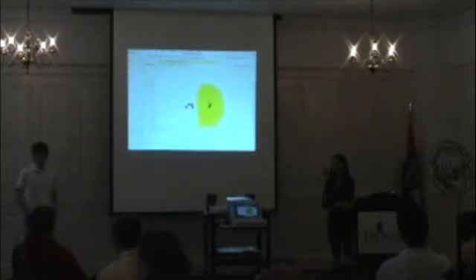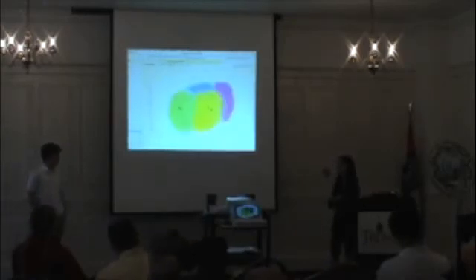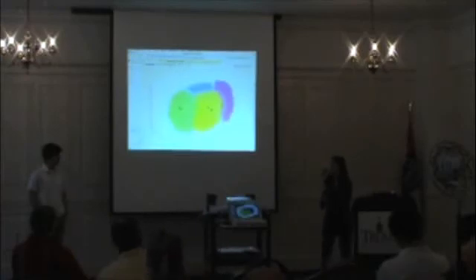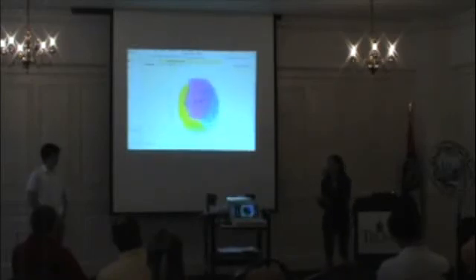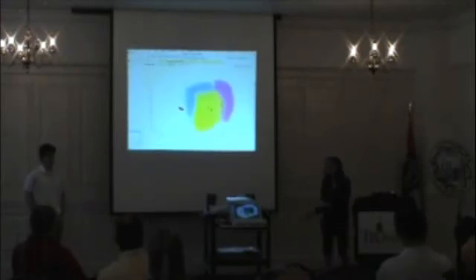So, are you planning to go with this combination method for your segmentation? I think so. We're going to do some more research. Picking an algorithm, I think, will be based off of ease of implementation to some extent. Like, if it's something that I can't learn in 10 weeks, then that's not going to work. Also, accuracy is probably the most important one, because if it's not accurate, then it might as well be segmented by hand. And efficiency is kind of secondary.